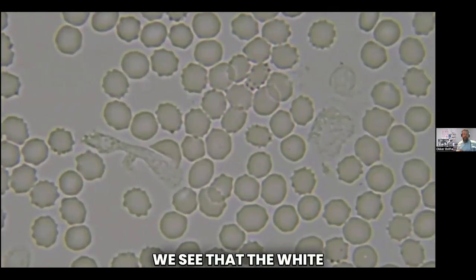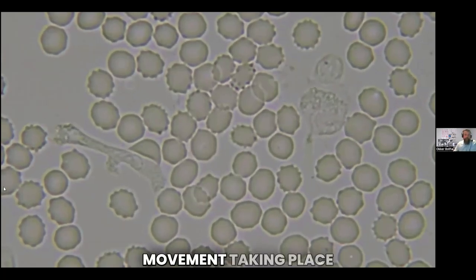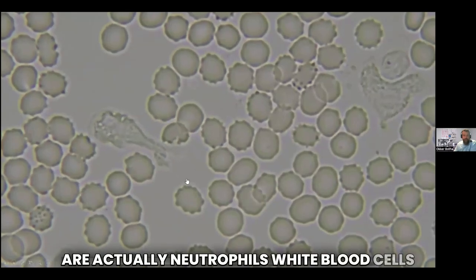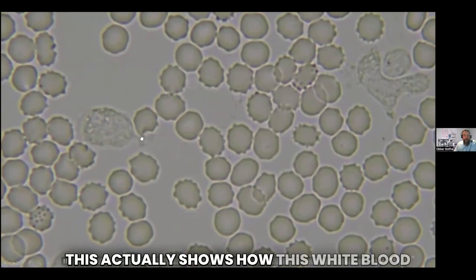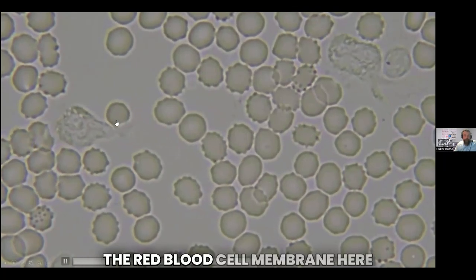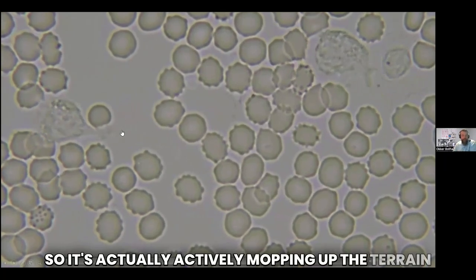And we see that the white blood cells behave like they normally do. So we can actually see all this movement taking place, these gray structures that are moving around like this. These are actually neutrophils, white blood cells. And we can actually see them working. This actually shows how this white blood cell is busy cleaning up issues with the red blood cell membrane here. So it's actually actively mopping up the terrain.